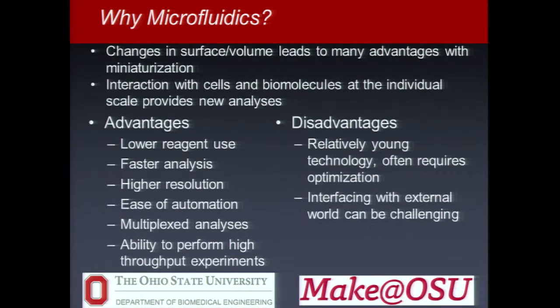As I said, a lot of this has been shown from a biochemical point of view: miniaturization can increase certain behaviors, and that really comes down to just as you go to smaller sizes, your surface to volume ratio becomes higher, and therefore effects that are surface-based, such as transport of heat, transport of energy, get increased relative to the volume of the sample that you're interacting with, and so you get much faster putting things in, taking things out. You can also use this for affinity-based separations where interaction with a surface is what really determines how much you can separate these out.